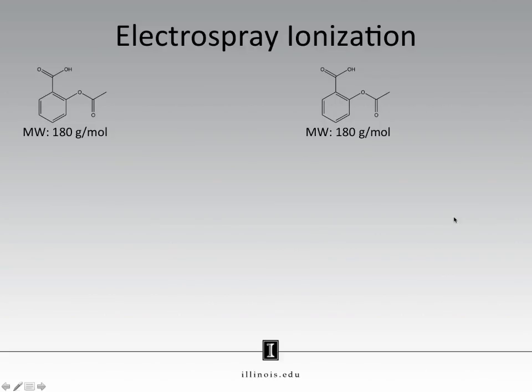On this slide, we see the structure of acetylsalicylic acid, better known as aspirin. Aspirin has a molecular weight of 180 grams per mole.